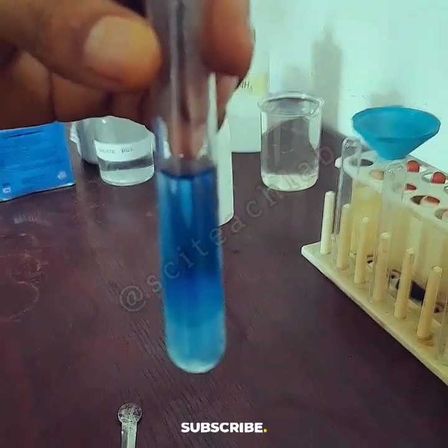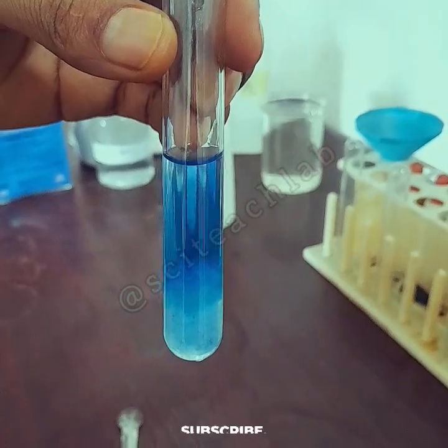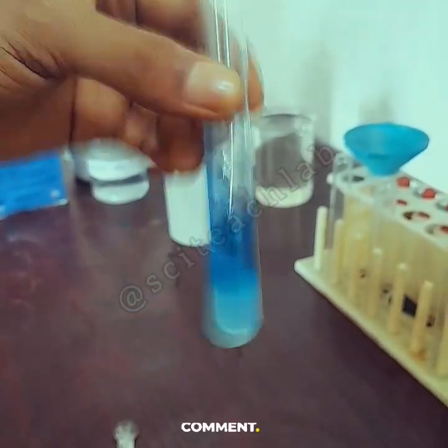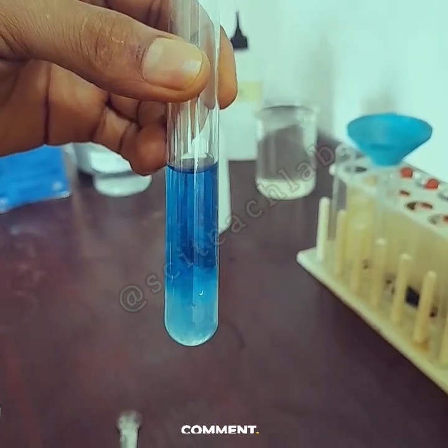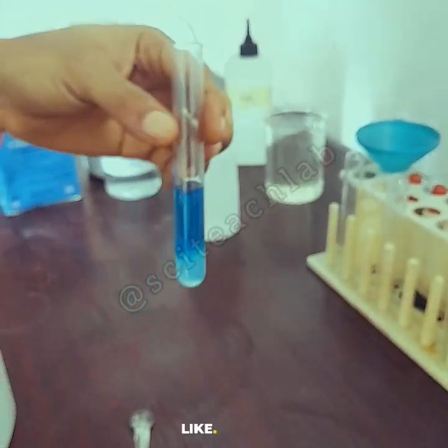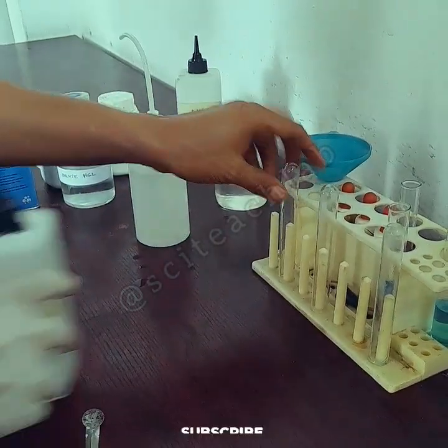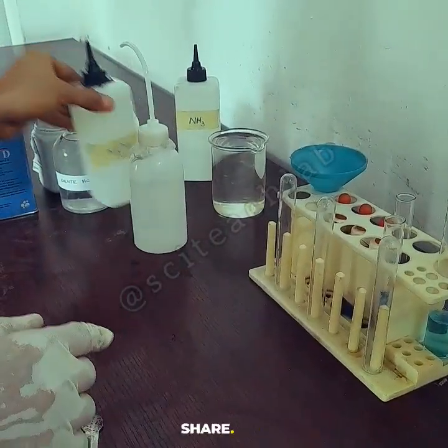So that is a hint that copper may be present here. You are trying to confirm that there is copper. The Cu2+ ion should not dissolve in excess sodium hydroxide, and we have seen it didn't dissolve, so we suspect that there is copper. So we write Cu2+ present.